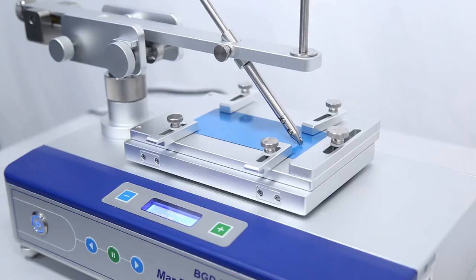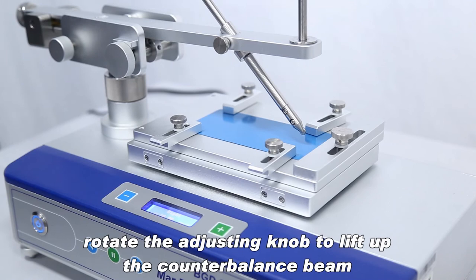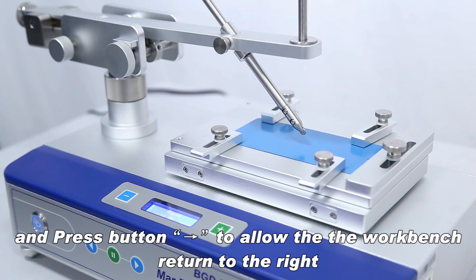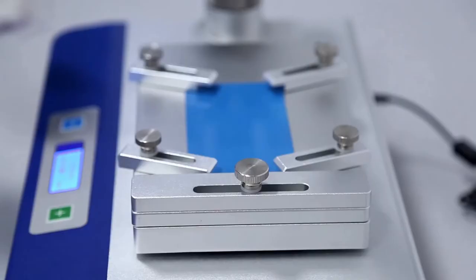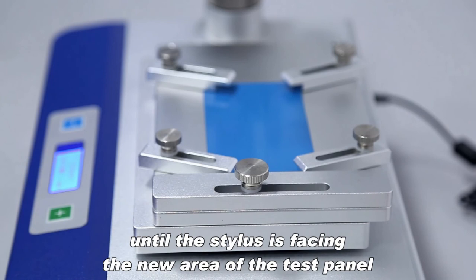Inspect the coating for scratching under a suitable magnification or with the naked eye. If you need to perform the scratch test at different position on the same test panel, rotate the adjusting knob to lift up the counterbalance beam and press button to allow the workbench return to the right. Loosen the fixed screw for holder on the right end of the workbench. Move the bench back and forth until the stylus is facing the new area of the test panel and do the scratch test again.